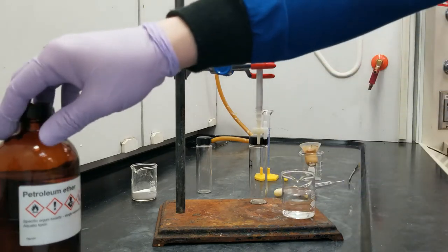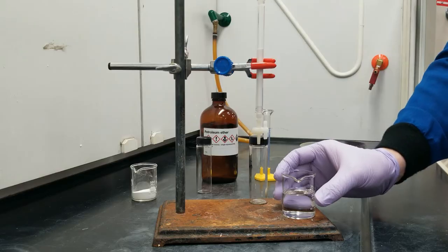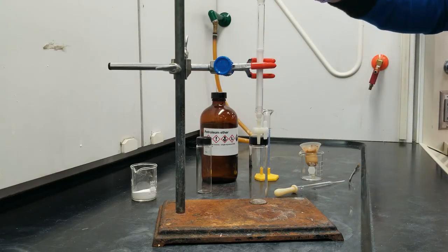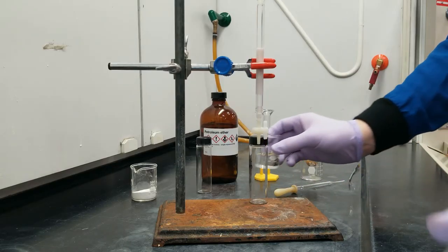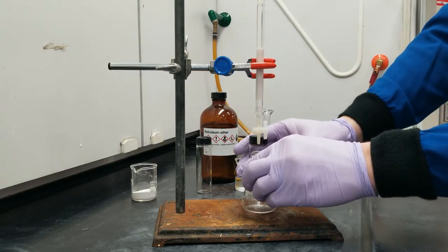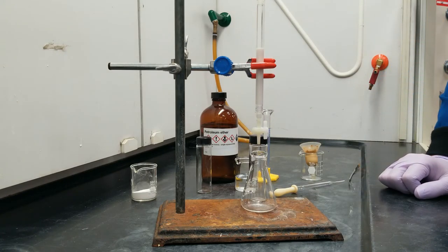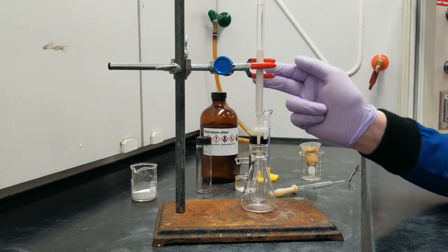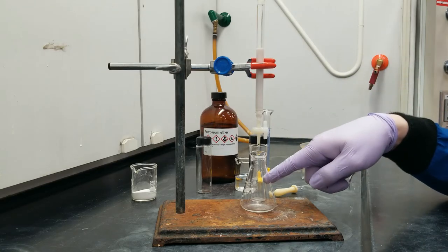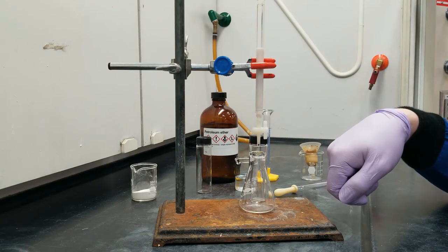Alright, so I've got petroleum ether in here just for pouring, and I'm going to gently run it down the side as to not disturb my alumina. And what you guys are going to see is this line of wetness which is running down the alumina. And that's my petroleum ether wetting it down. And when it's wetted down, organic molecules can run down with it. And we should see a little drip there. Boop! Very nice.